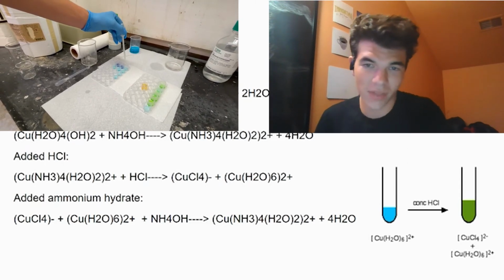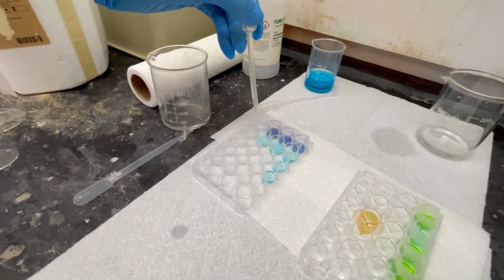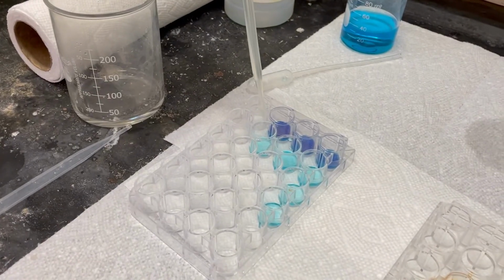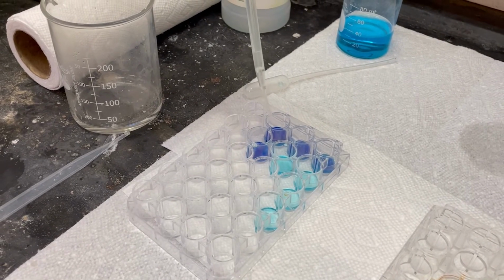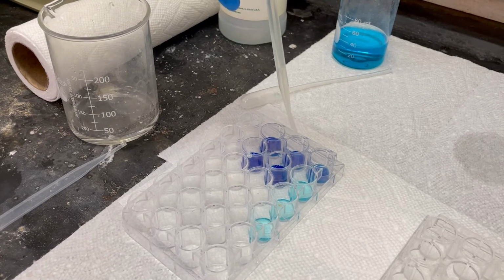By continuing to add the ammonium hydroxide, it shifted the reaction into the complex with water, ammonia, and copper. This was a dark blue color, and it can be seen in the video as it goes to completion, which is what I expected.